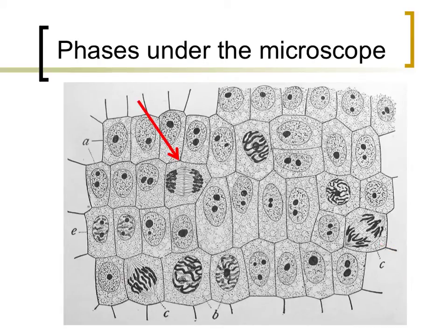During telophase, the nuclear envelope begins to reform and, in plant cells, a cell plate begins to reform. The cell plate, shown in this picture, looks like an incomplete section of the cell wall in between two half-sized cells.